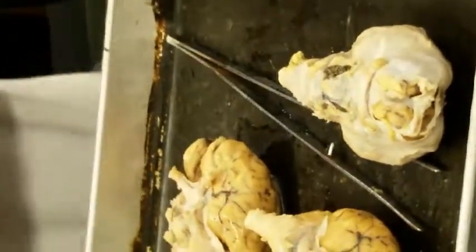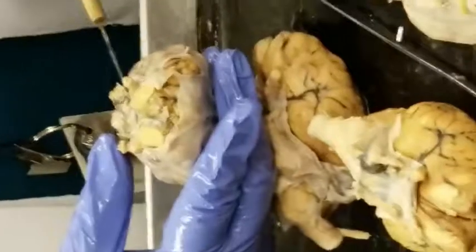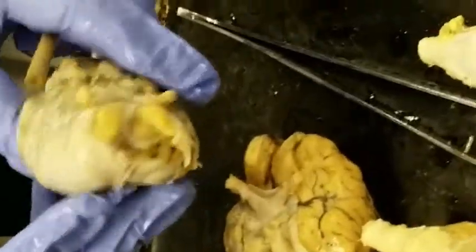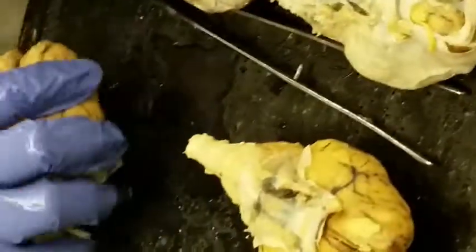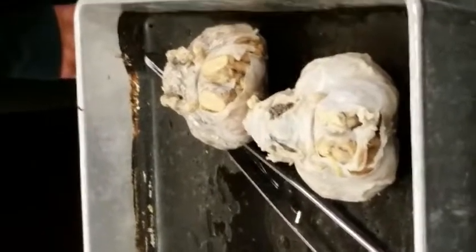Remember, you can put gloves on and go in this bucket later. The covering of it. The olfactory bulbs, yeah. And what are these? The optic nerves, and right in the middle would be the optic chiasma. So this is a nice one to dissect. Take this off, and then you'll find the pineal body. The pineal body is much nicer than on the model. Corpora quadrigemina is another, and also the optic chiasma.